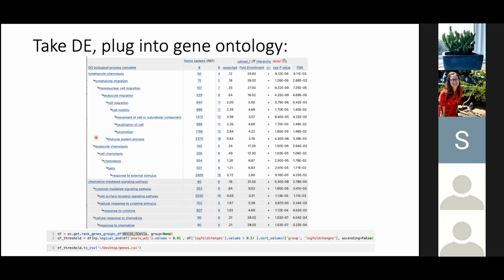Again, this is practically its own talk by itself. I don't have any good examples here, but this group. Okay, so I guess what are we looking at here? You have this tag associated with different genes. Basically you're asking the question, of the genes that I gave you, how many have this tag, and how many should you expect to have this tag? So is it random chance that you get this many genes that have this tag, or is it not random chance?